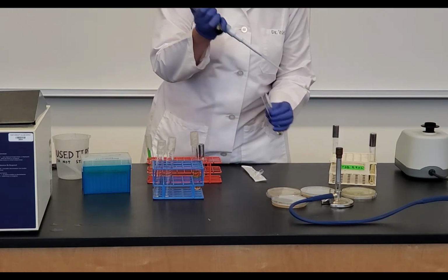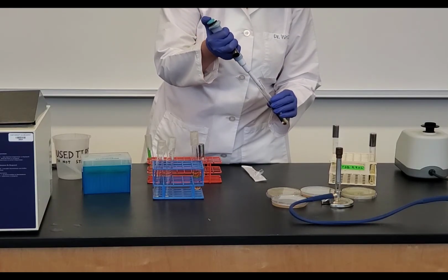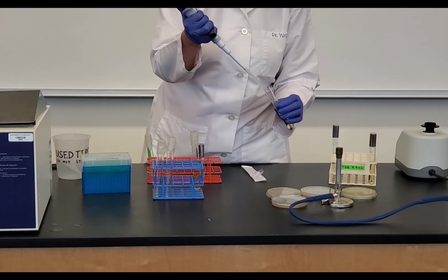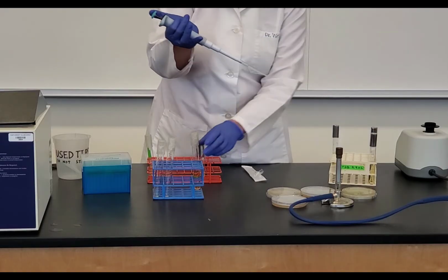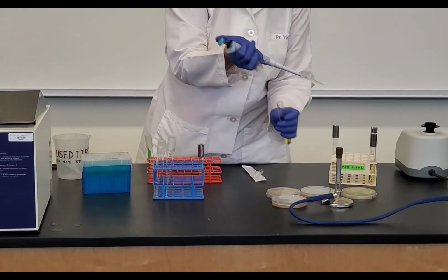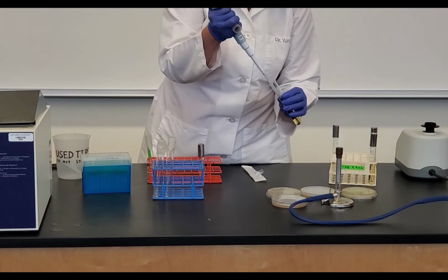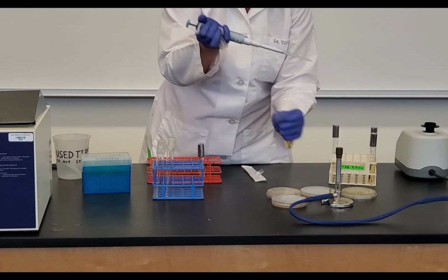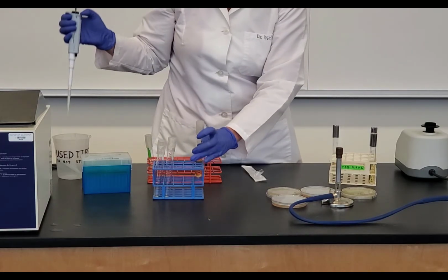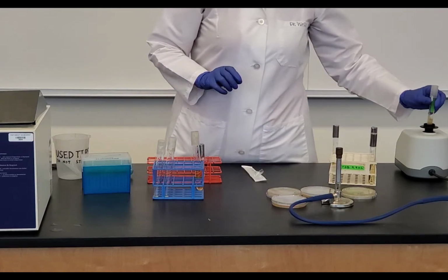Take the cap between my pinky and ring finger, flame the opening, put my tip in, slowly release my thumb to draw the liquid into the tip, flame it, recap it. I'm going to add that to my agar deep. Flame it, pipette it in, flame it, cap. Now I'm ready to add my E. coli, so I'm going to vortex again.